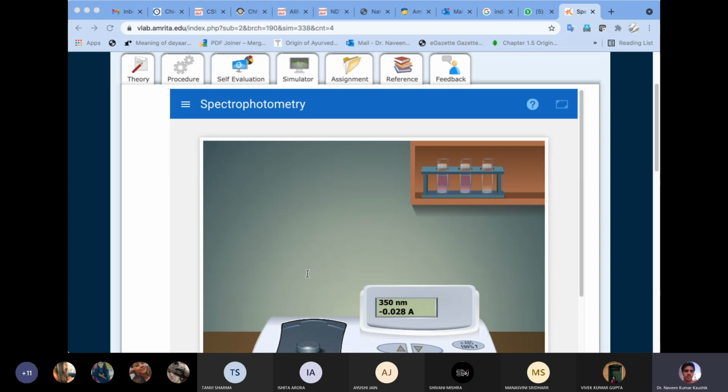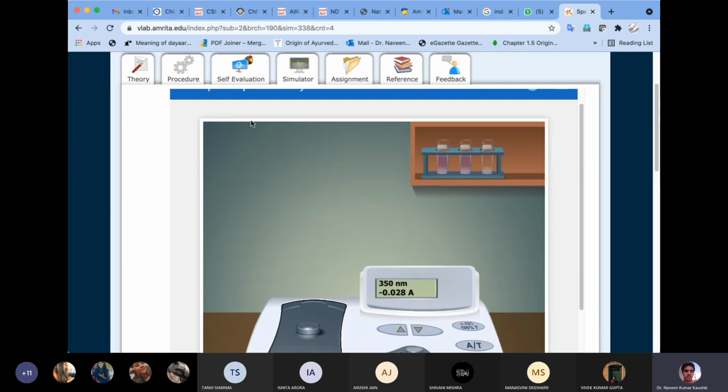Transparent and clean. And one more thing is to avoid cross-contamination. Cross-contamination means, while you are using pipettes, use a new pipette for every new sample. Don't mix them, because this contamination is going to be harmful. Maybe one sample is pure, another sample is impure, and you are using the same tip, same pipette for both. Then the sample which really is pure, because of your cross-contamination, you will find that your sample is impure. So don't do that. These are a few precautions that you must keep while performing your experiment or while reading out your results.